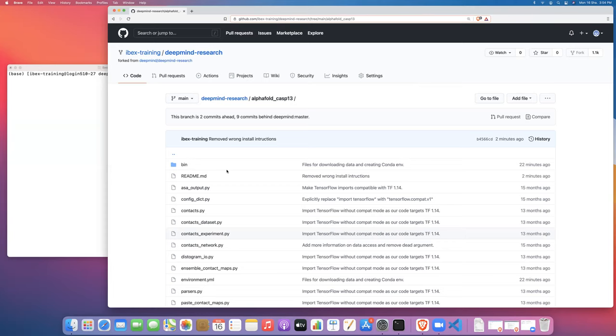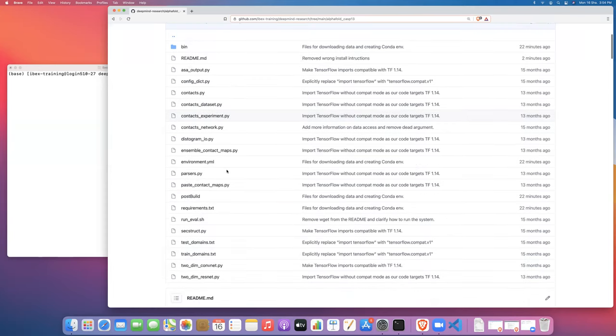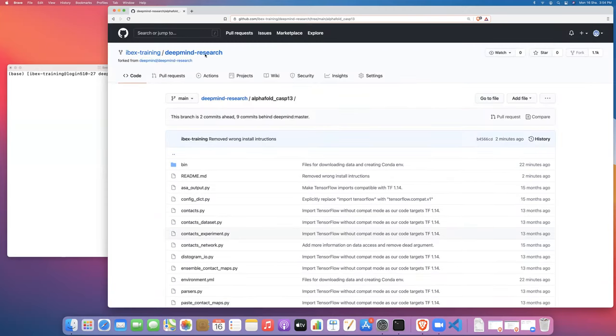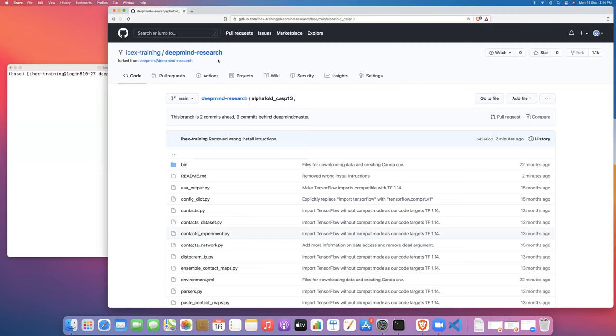So in the previous video I showed you how to launch the job script to download the data. I'll assume that you followed through the previous video. You've already cloned the DeepMind research repo from the ibex training, which is just a fork of the original DeepMind research code.